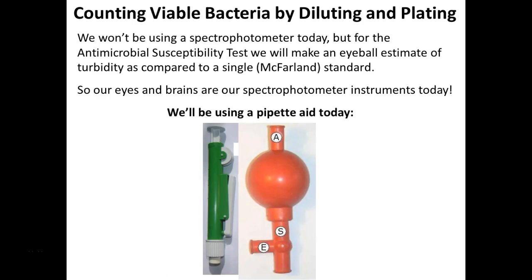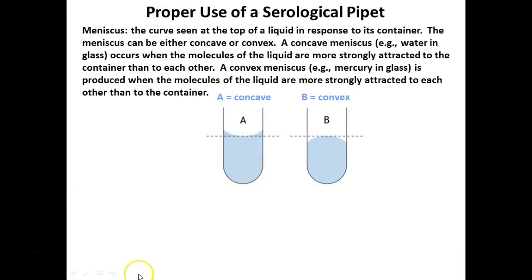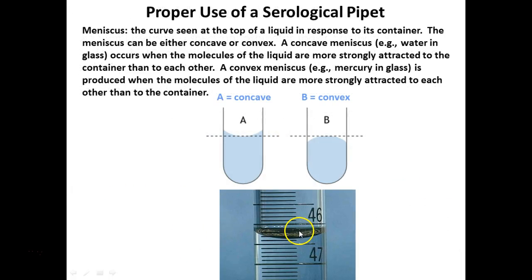As I said, we're not actually going to do the whole thing. So some of the things that we use for pipetting, we have these different devices here that allow you to use pipettes like these, right? Serological pipettes. I don't have one right in front of me right now. I have them in the back. For large volumes, like milliliter volumes, right?